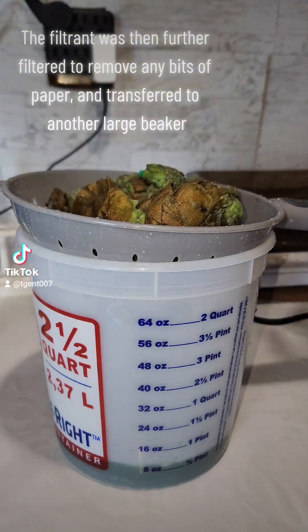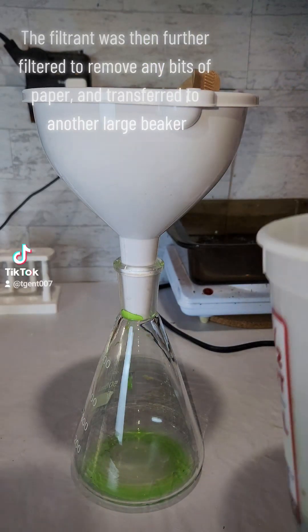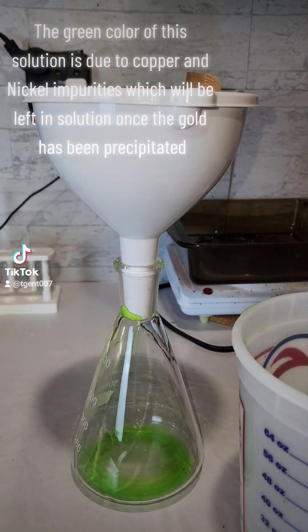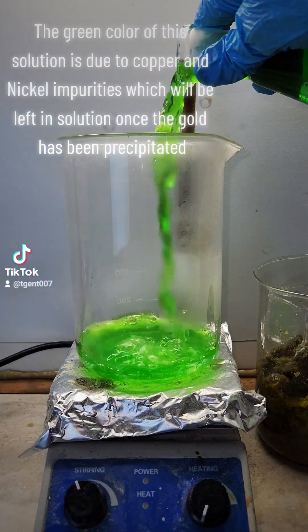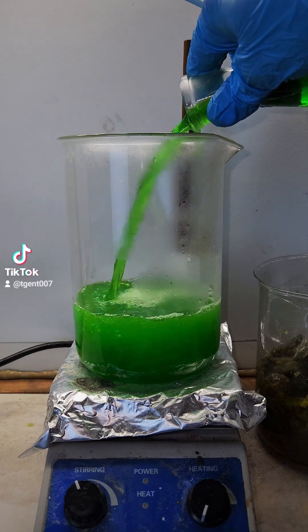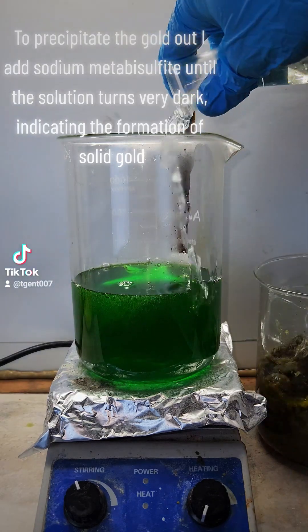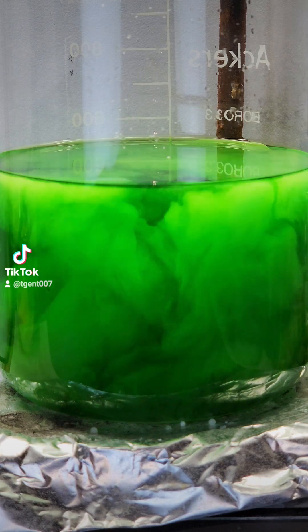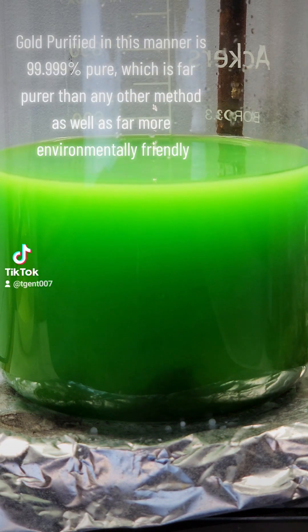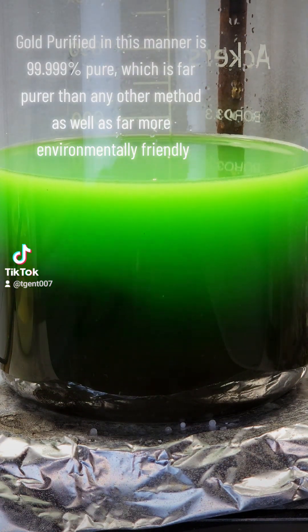The filtrant was then further filtered to remove any bits of paper and transferred to another large beaker. The green color of this solution is due to copper and nickel impurities, which will be left in solution once the gold has been precipitated. To precipitate the gold out, I add sodium metabisulfite until the solution turns very dark, indicating the formation of solid gold. Gold purified in this manner is 99.999% pure, which is far purer than any other method as well as far more environmentally friendly.